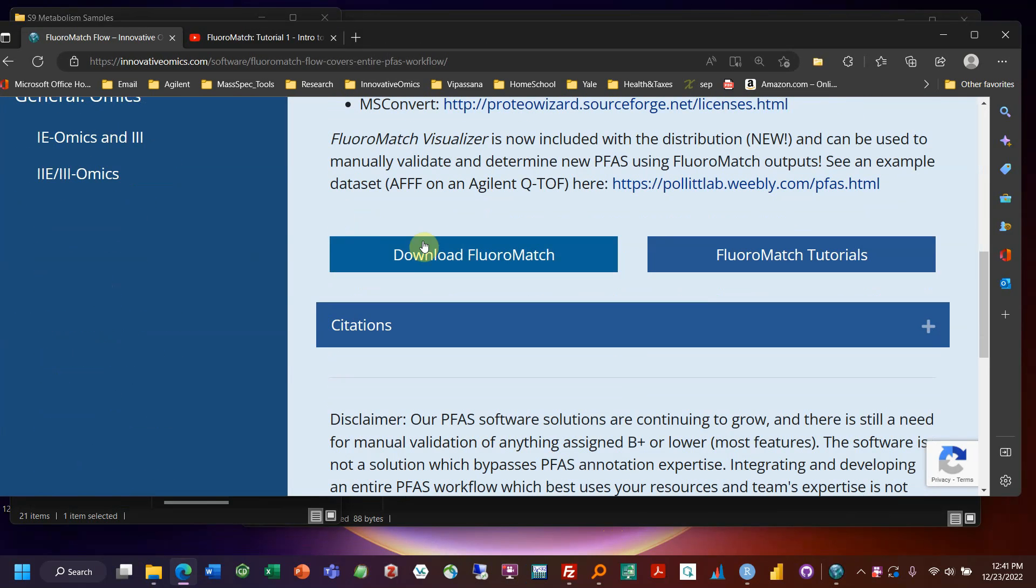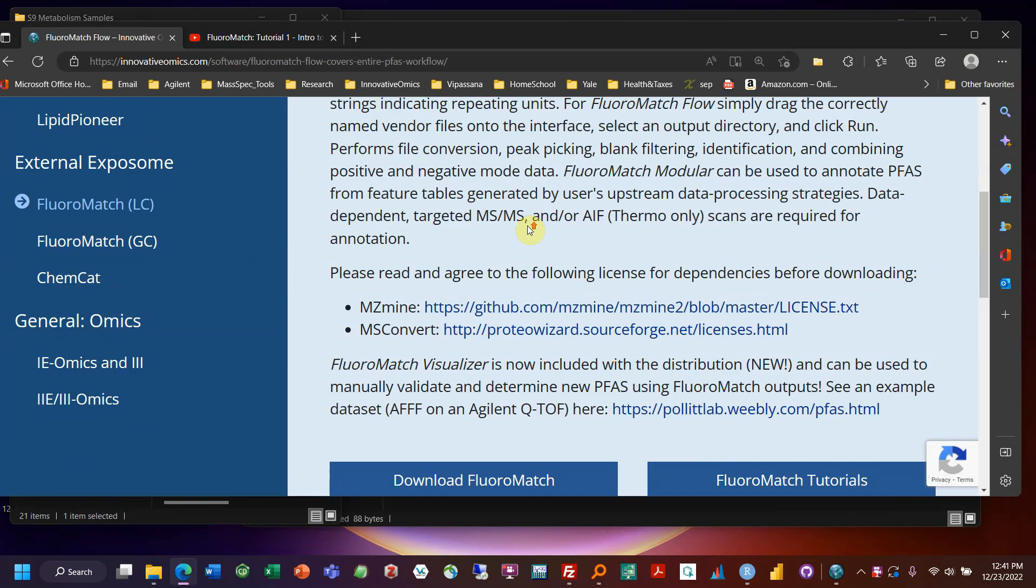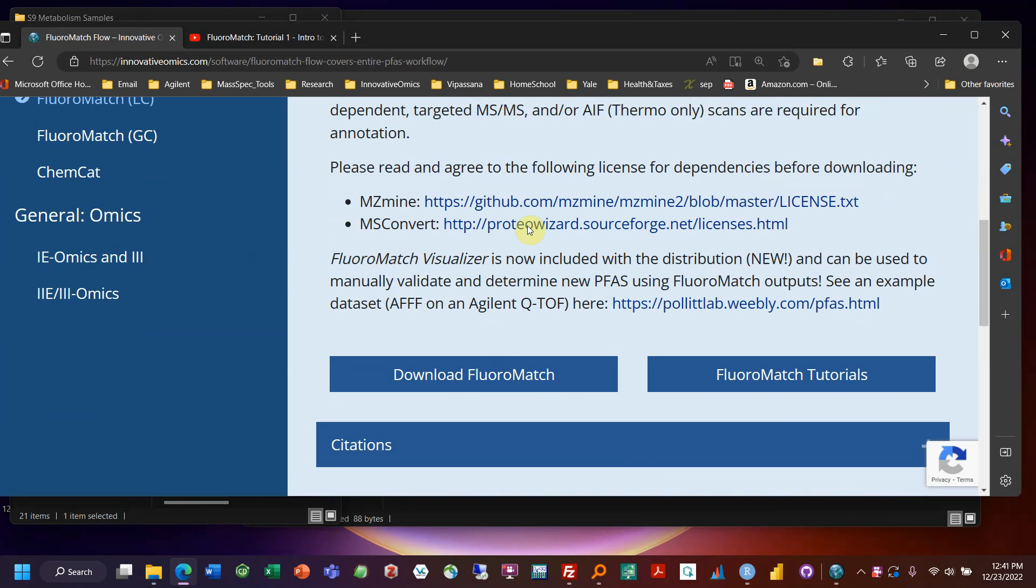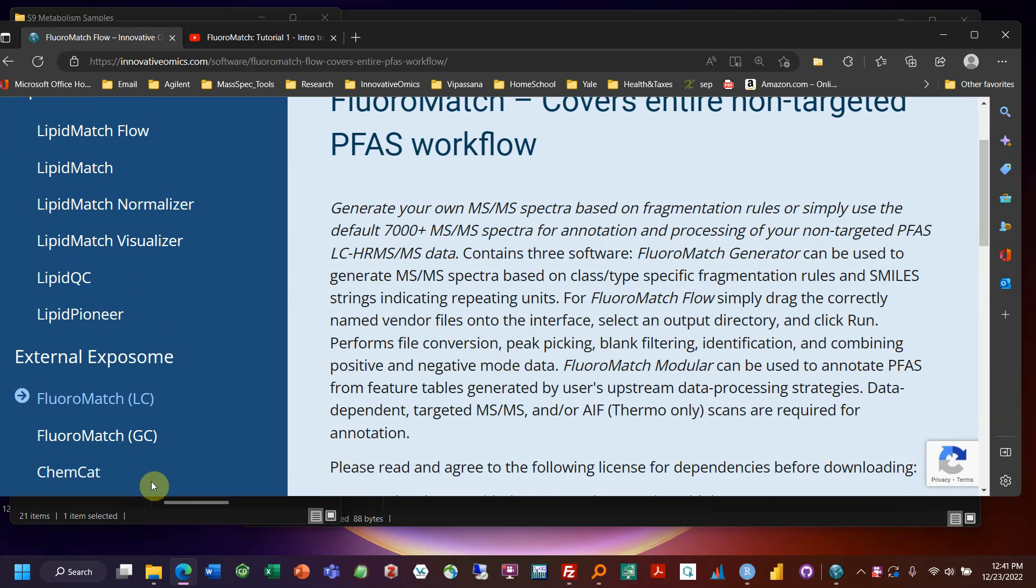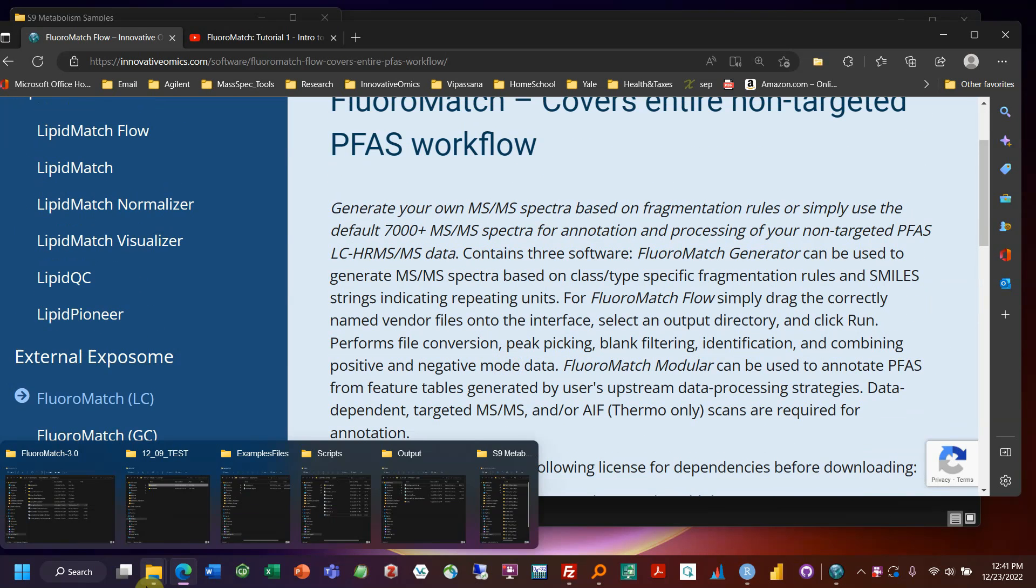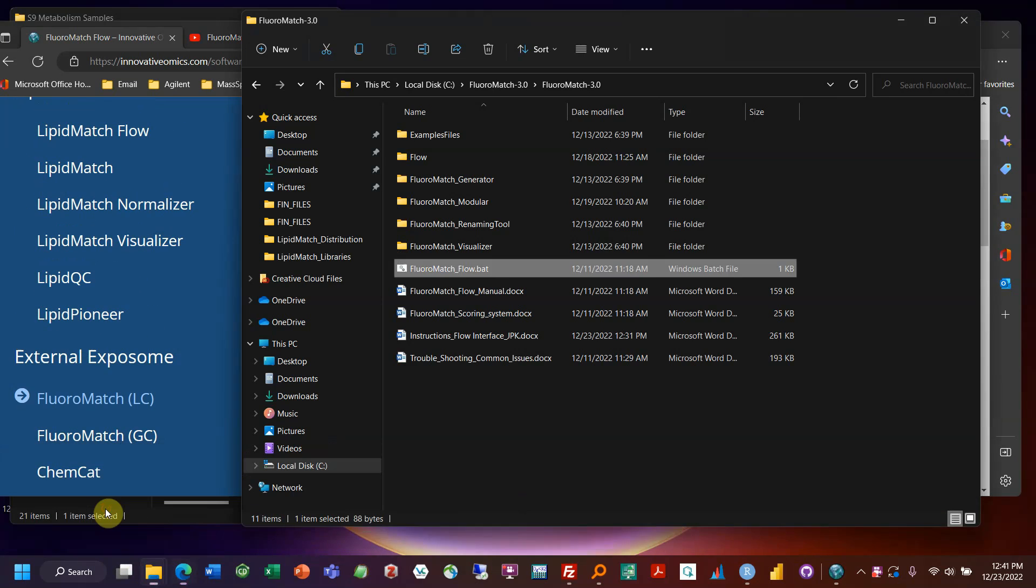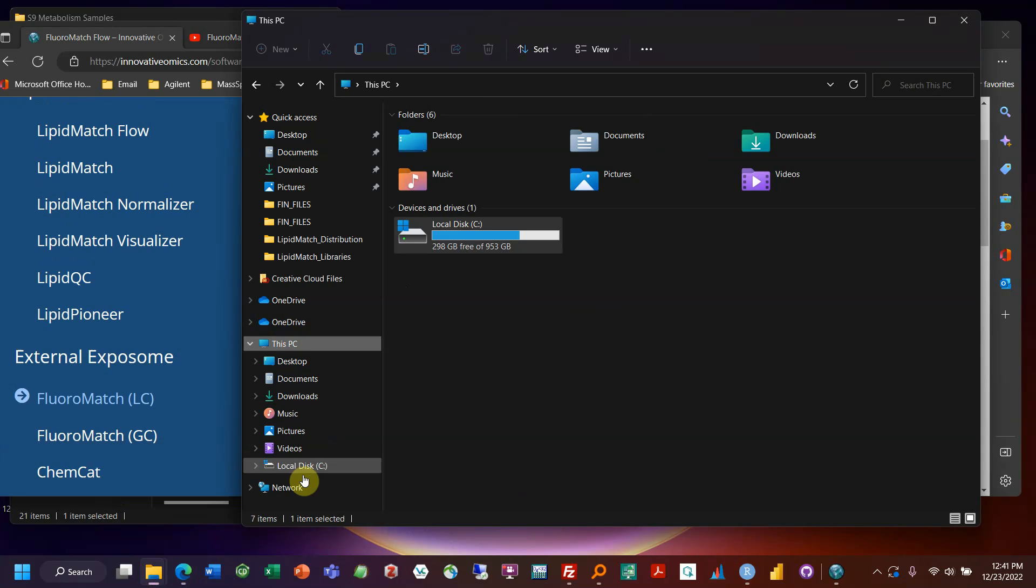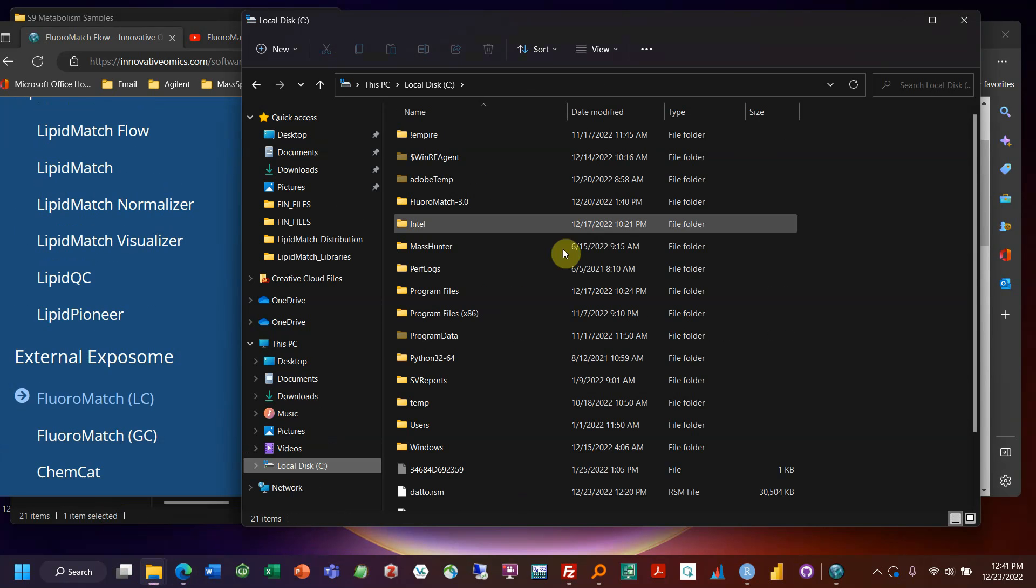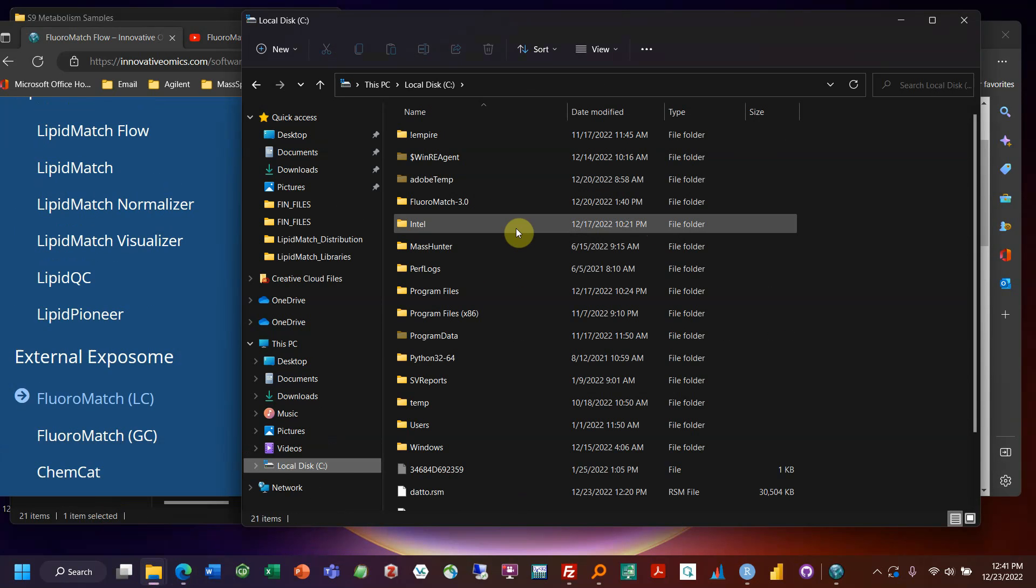First, as shown before, you download FloroMatch and you'll get a zip file. Now we recommend you extract that zip file in your C drive. So if you go over here, you can go to this PC, C drive, and extract it over here, or once you extract it.